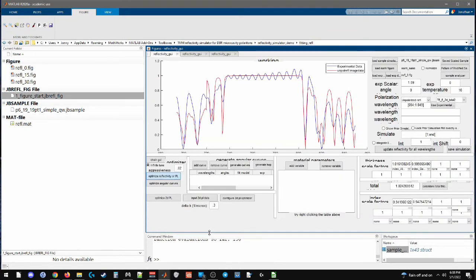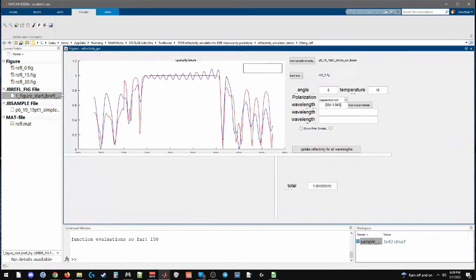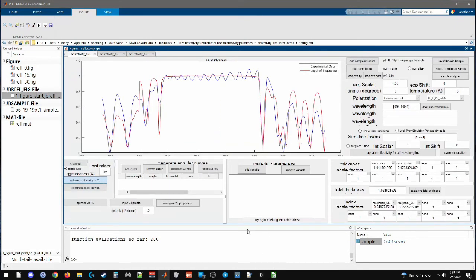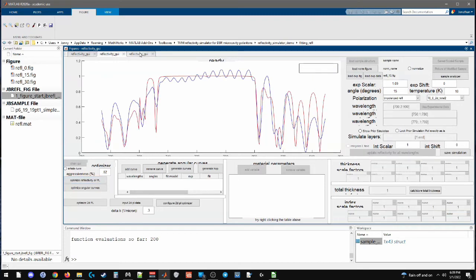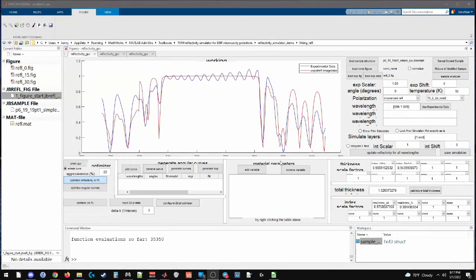And then, yeah, once it has the next draw update, we'll get to see this GUI correctly. Okay, looks a little bit squished, but we can cycle through and look at how the fits are going. All right, I'm going to let this run for maybe 30 minutes, and then I'll come back. Okay, we're back.